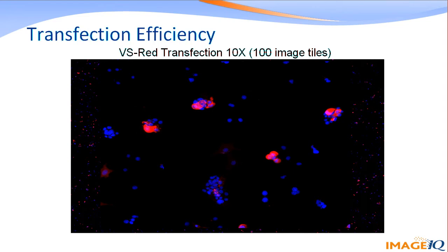And this is just a highly zoomed up image of a particular portion of that previous large field of view image, and you can see that the protein of interest is actually sometimes located directly over the nucleus or surrounding the nucleus in the cytoplasm.